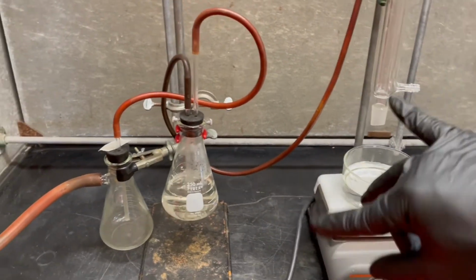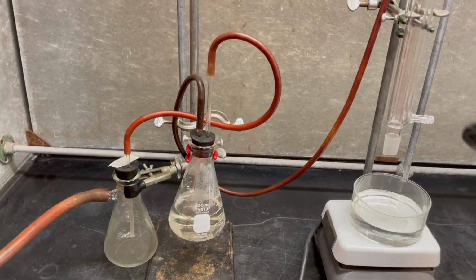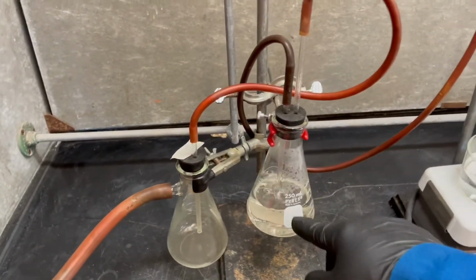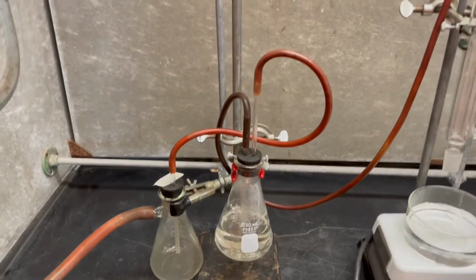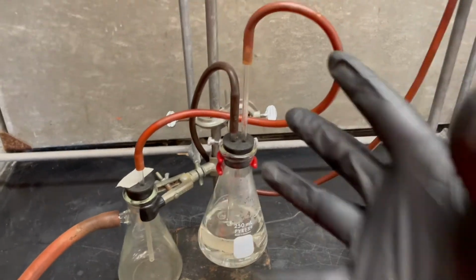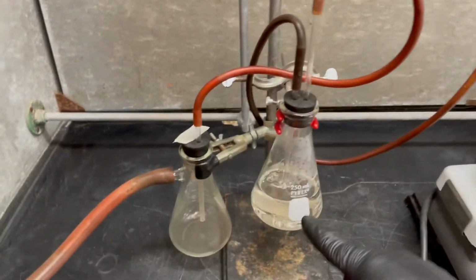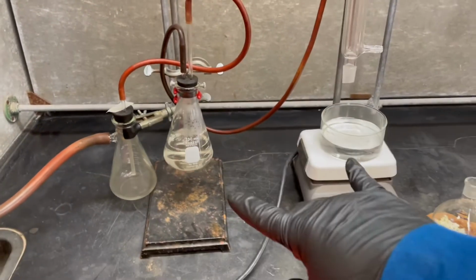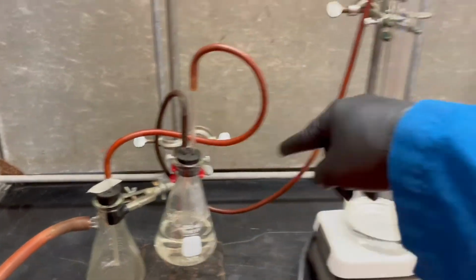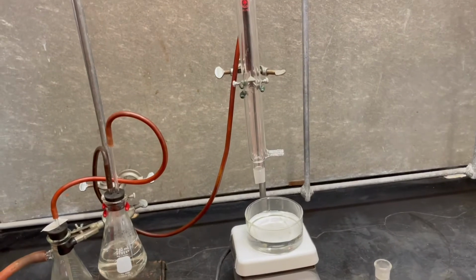So let's say we heat it, it starts to cool, and then we had it bubbling through here this whole time, right? That was because of the gas expansion, and then when it cools, everything condenses down. So then there's a pressure differential between the two, and it creates a vacuum in this sodium hydroxide solution. We get sucked up inside of our reaction and destroy it.